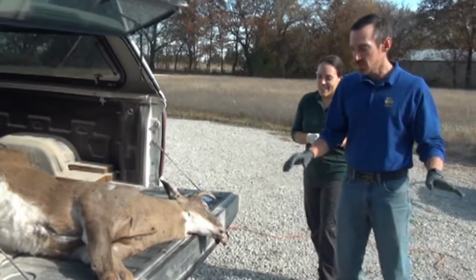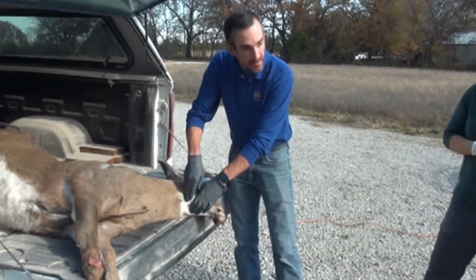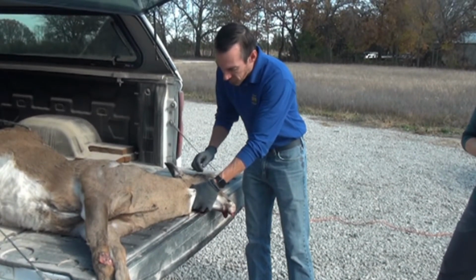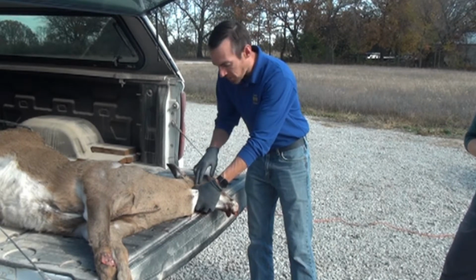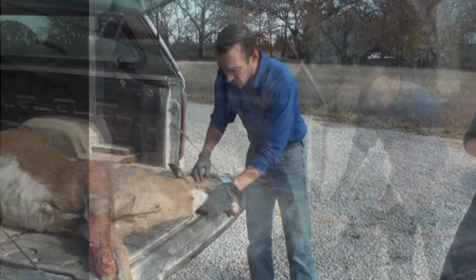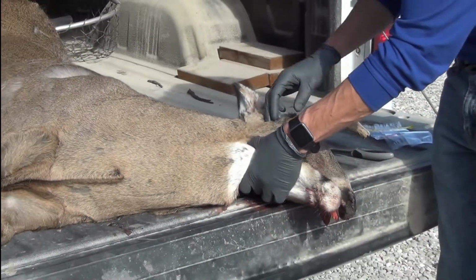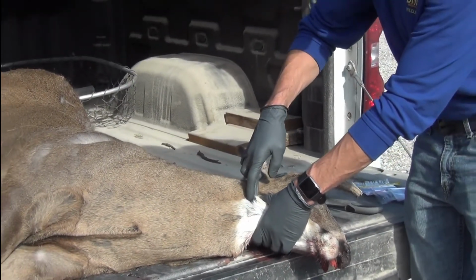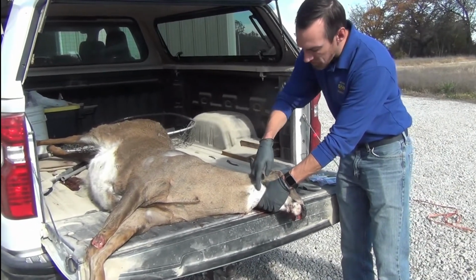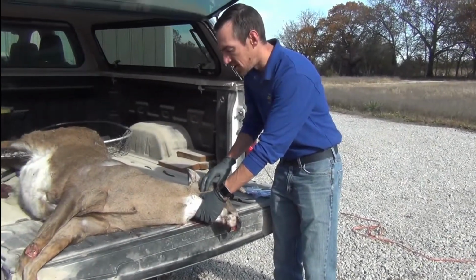Okay, so first things first, you have your deer laying down here. We're going to make a cut into the neck right about here, and your landmark is essentially you just feel for the bottom of the jaw, where that hinge is, basically right here in the neck. If you're feeling along here, you can feel the solid jaw go all the way back just below the ears. You can feel where that hinge is. That's essentially where we're going to make our cut. So we're going to cut right through here, cutting right up through the ears, and we'll show you how deep to make the cut so that you can actually access the tissues that we're sampling.